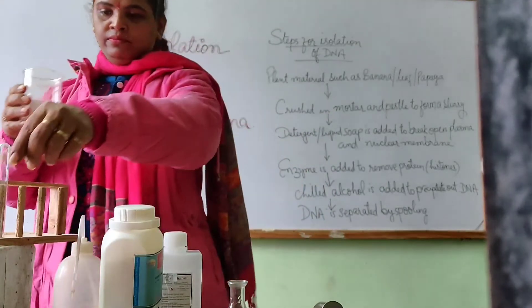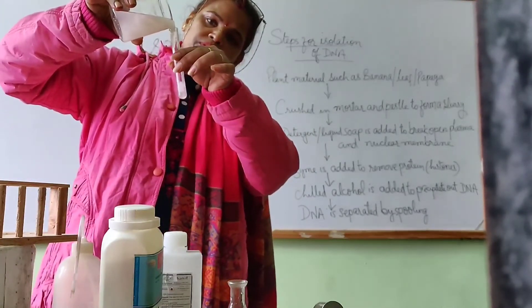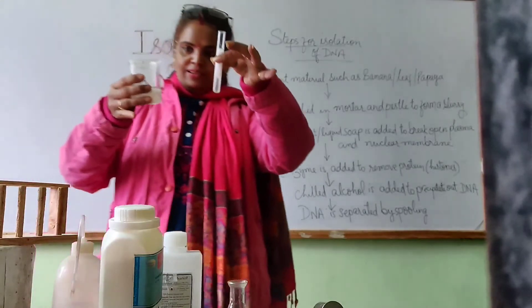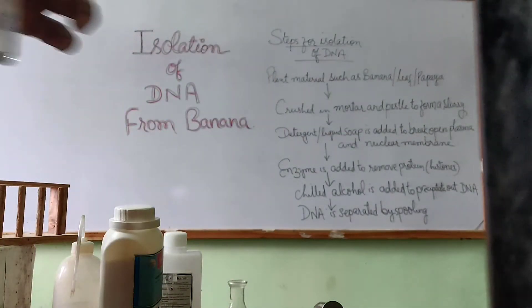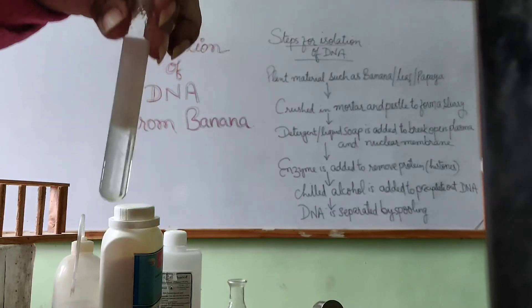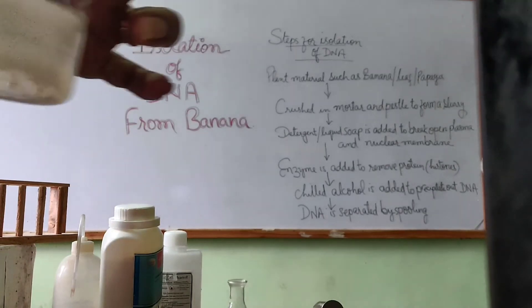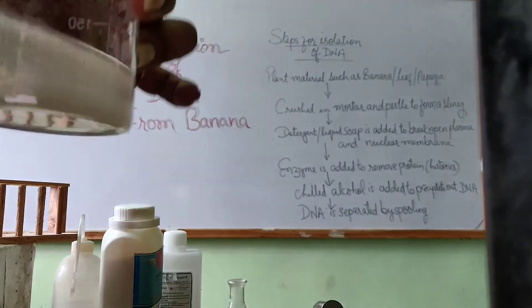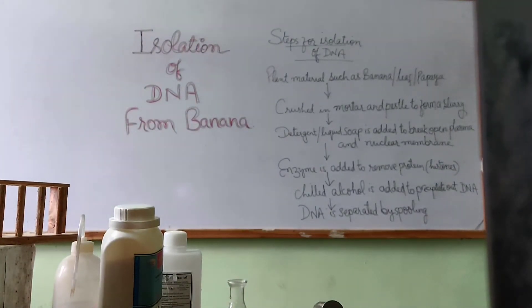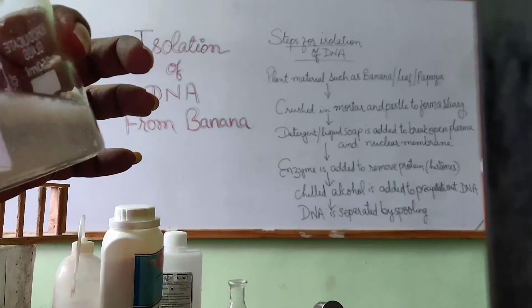I will take a sample in this test tube and show you. It thickens — yes, it's our success! This is isolated DNA. See, this is your DNA material. Here you can also see a thick layer on the surface of the solution — that is DNA material. You can see it with the help of this toothpick.